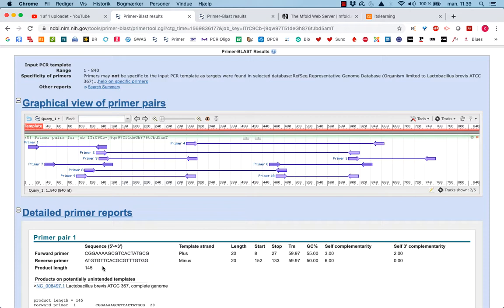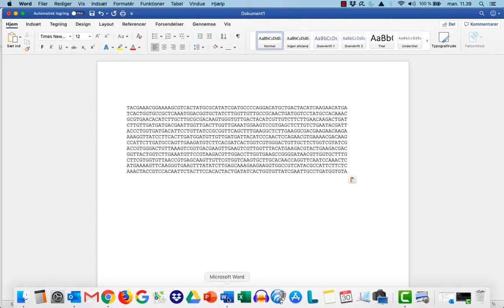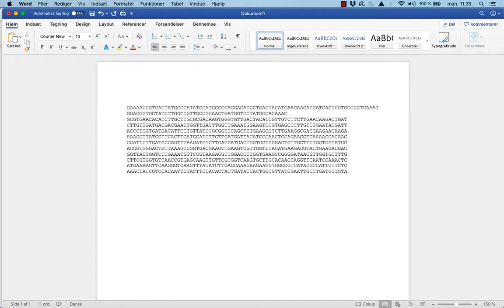These 145 bases long. So to analyze for that, what I've done is I've put it into Word, as low-tech as it can be. And 8 base pairs. 3, 6, 7, 8. 3, 6, 8. There are probably smarter ways to do this, but low-tech works for me.